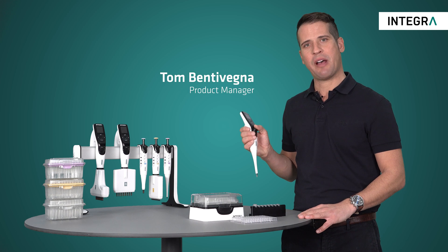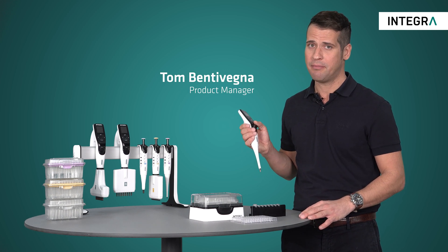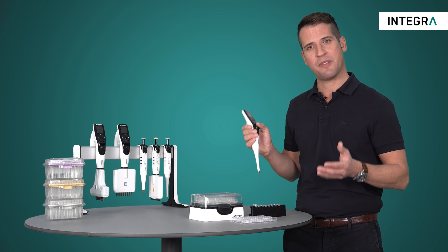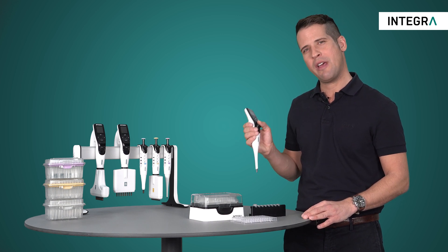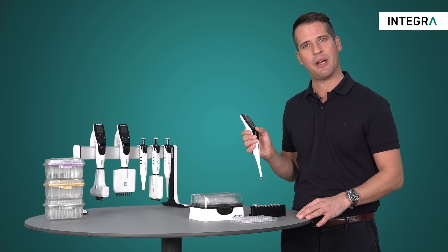One of the easiest and most basic pipetting modes which the Integra pipettes can perform is called simply pipet mode. By using pipet mode you can aspirate a specific volume and dispense that same volume back in one go. It's similar to how you may be using a manual pipet, just with all the benefits of an electronic pipet.